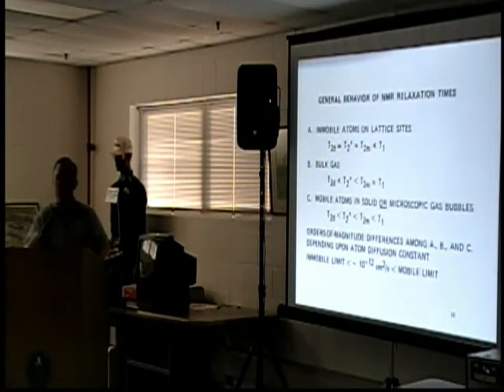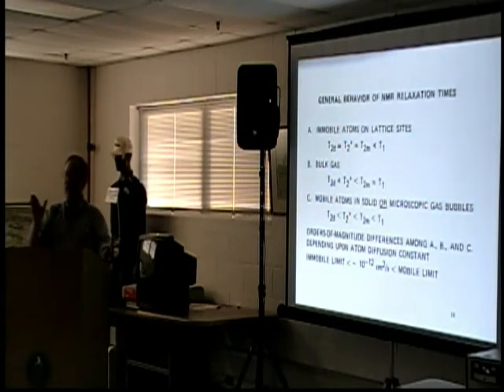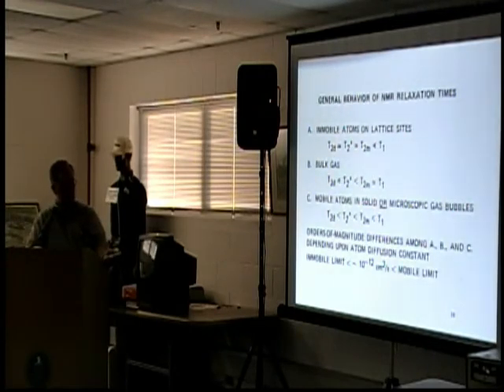On the other extreme, if you have a bulk gas, like hydrogen gas in a bottle, and now they're moving around, it averages all out. The spins can't transfer their spin internal energy very efficiently. It's only the T1 process that determines the T2, the spin time. And so now the rigid lattice time is orders of magnitude below what these time constants are. And this T2 star is typically the inhomogeneity of your magnetic field. You put a magnetic field in and it's not homogeneous across the sample, you'll see an effect. But if you do a Carr-Purcell sequence, you can average that over. And so the T2 is about equal to, or just slightly smaller, within a factor of 10 of T1.